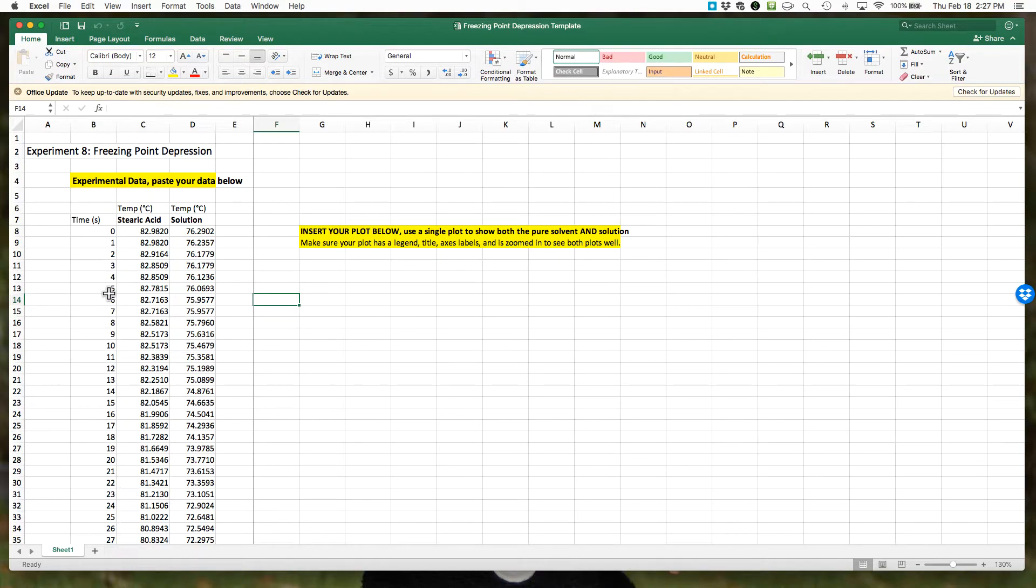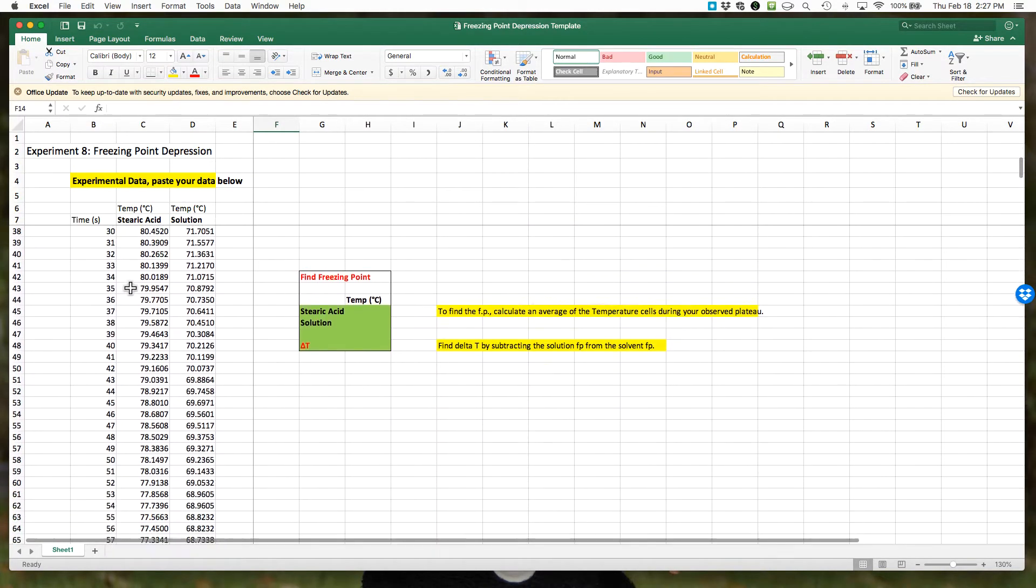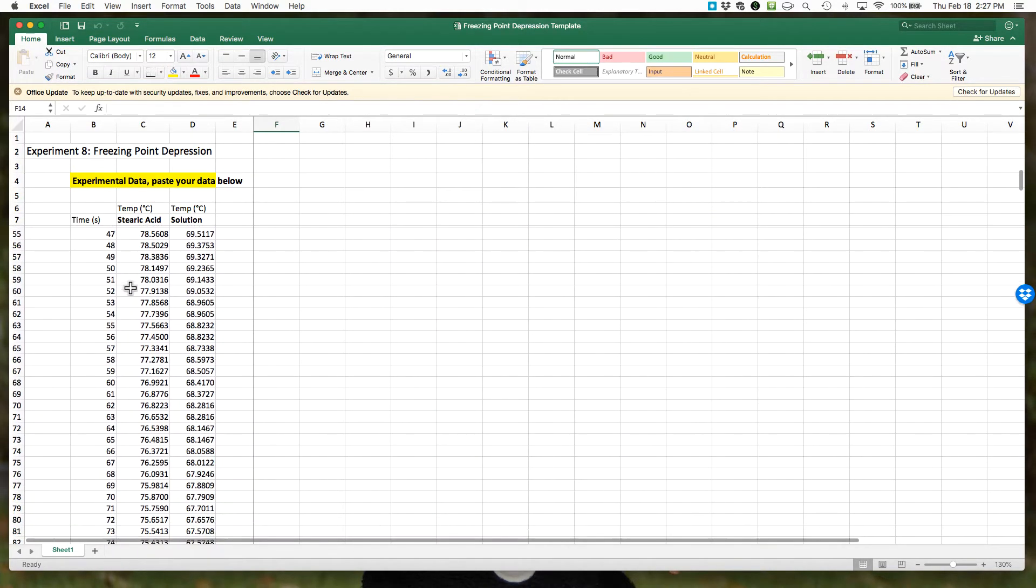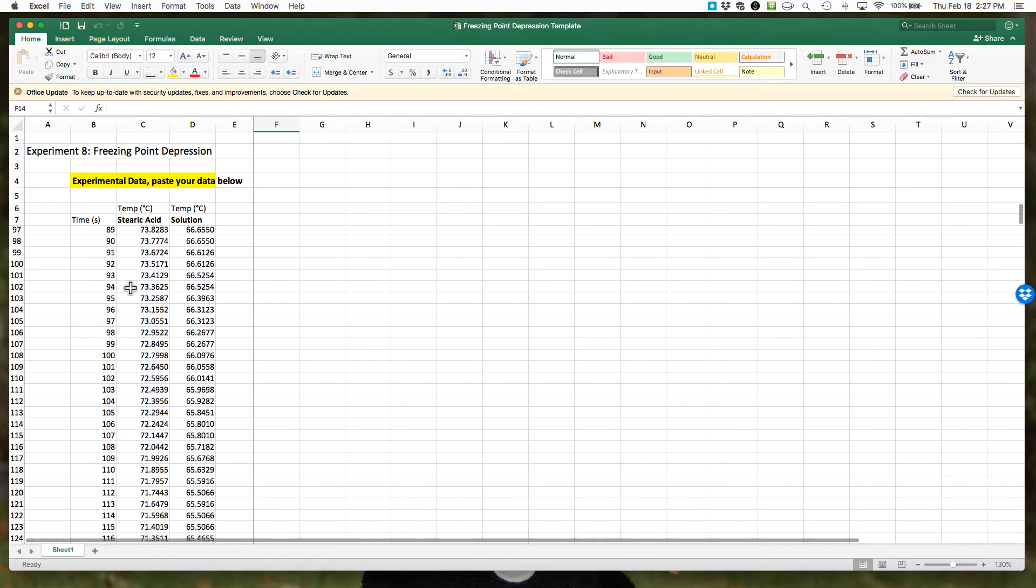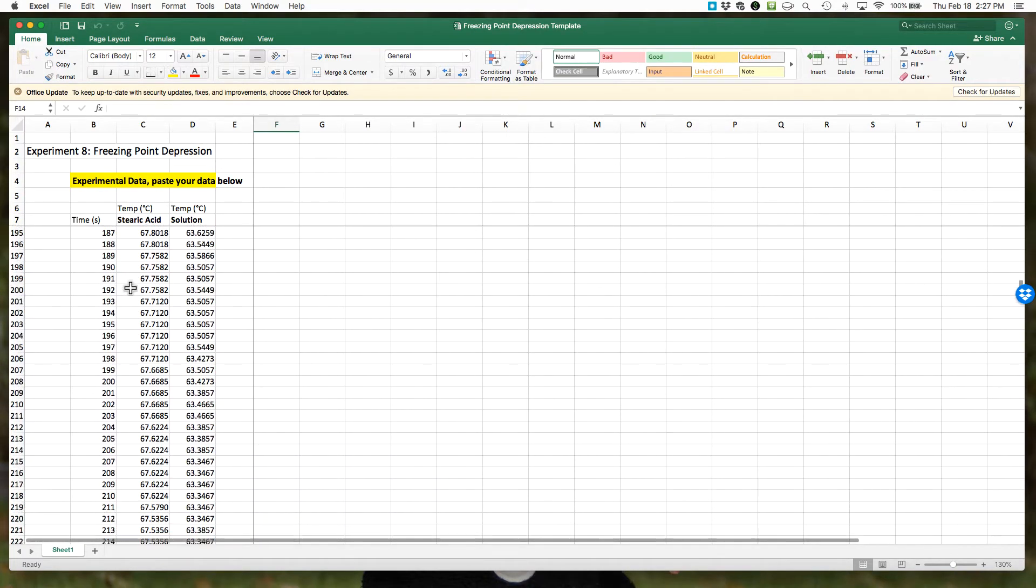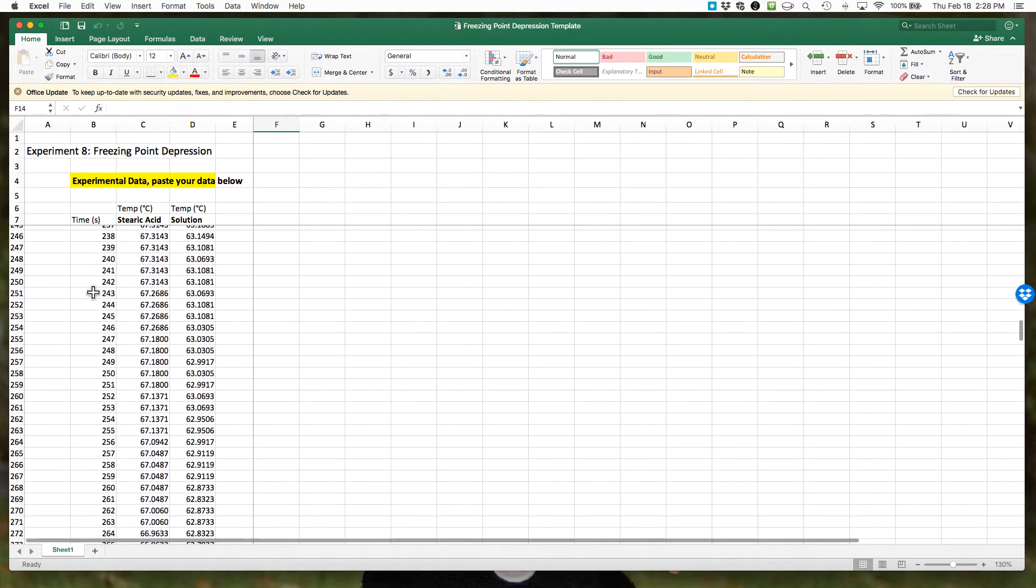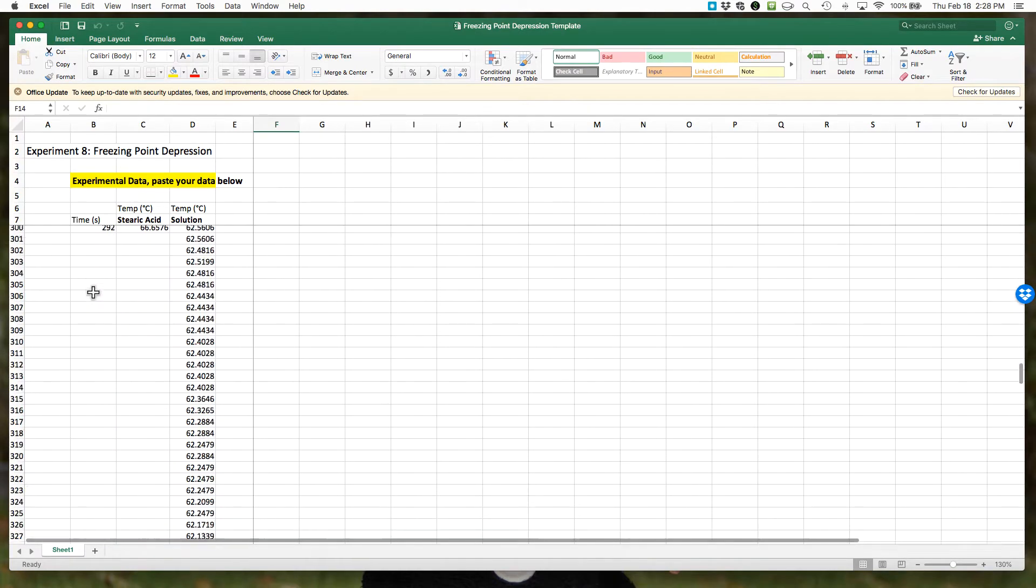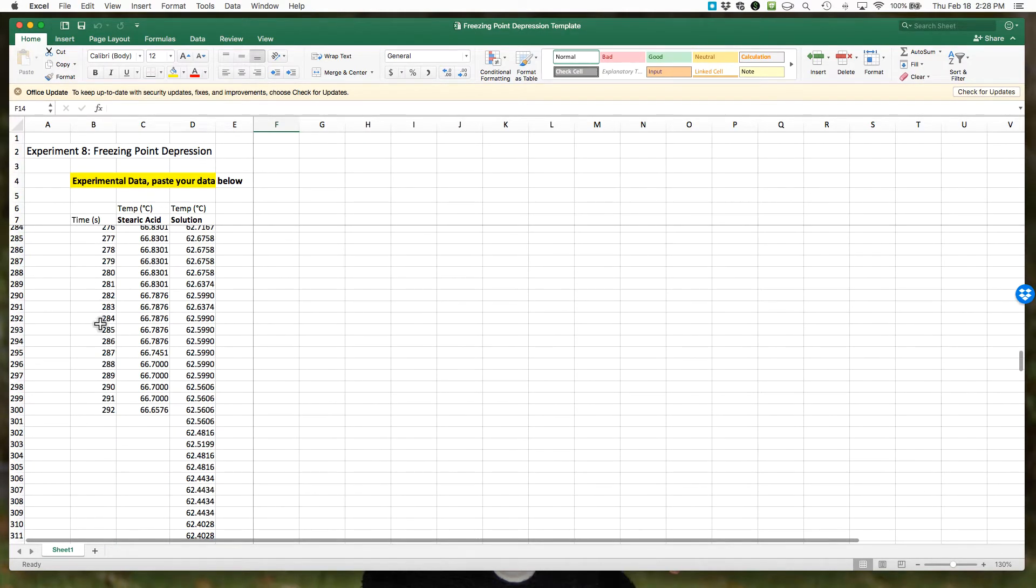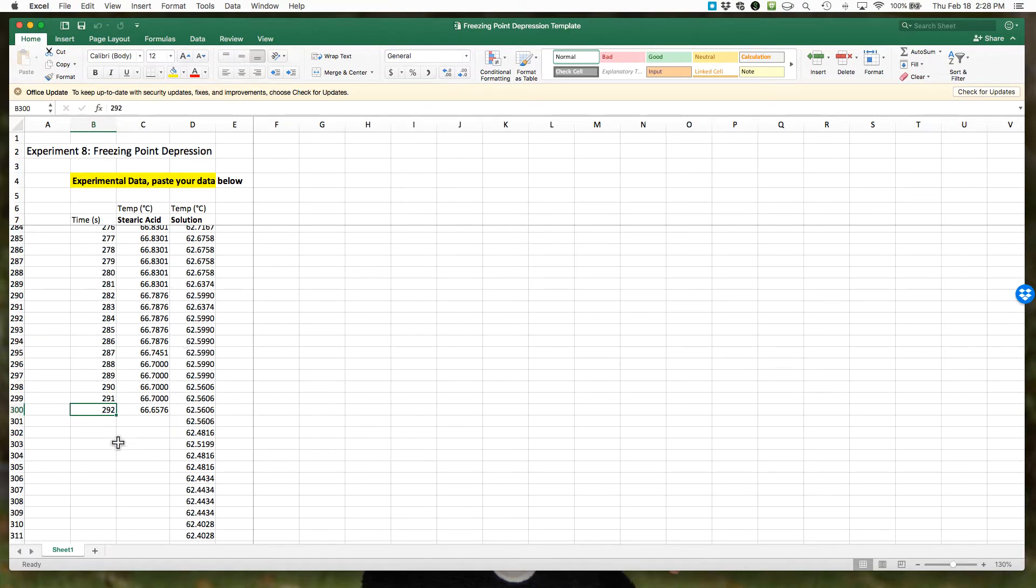Now what we're going to do next is check. I'm going to scroll down to the data just to show you. When we scroll down again we see our time and then our temperature data. Notice that my time data actually stops because the time data was pasted in with the steric acid, so it stops before the solution data.